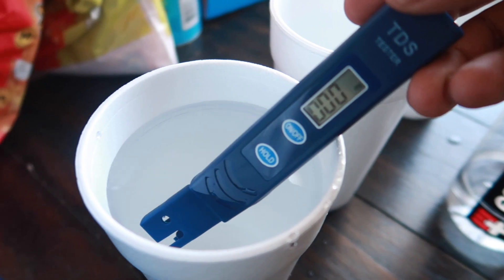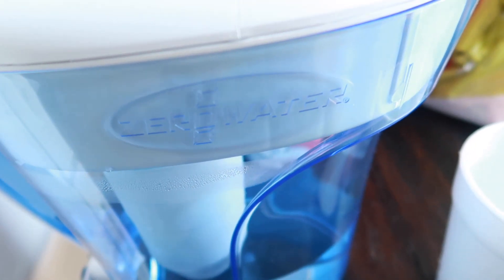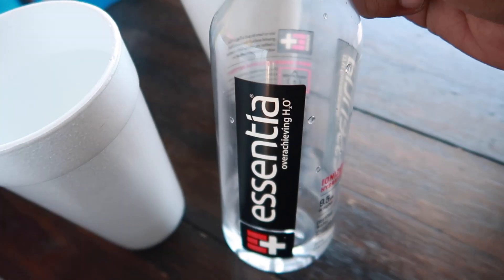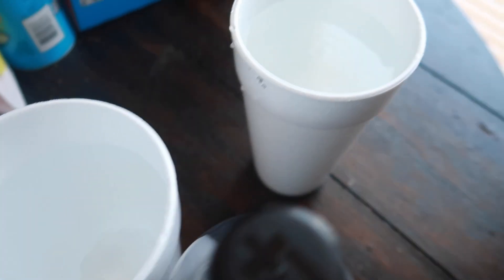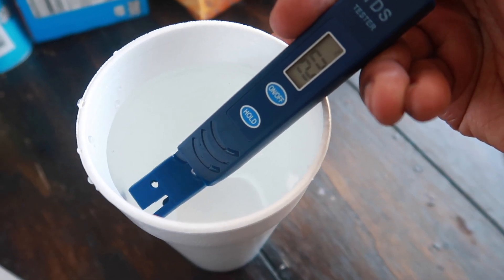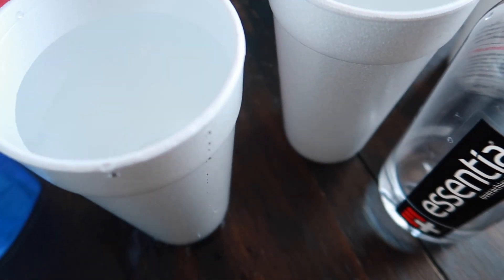Still reading zero across the board — it worked. I'm convinced. I saw an advertisement for Zero Water being the most purified water on the market and had to check it out. The Essentia is reading as high as 60 ppm total dissolved solids, and the Flint water, the Michigan Detroit water, is coming in at 120 ppm.